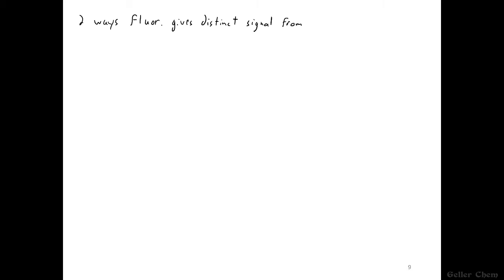And for the record, we would refer to that shined in light as the wavelength of excitation. The wavelength that is absorbed and excites the molecule, which will eventually lead to fluorescent light emission.